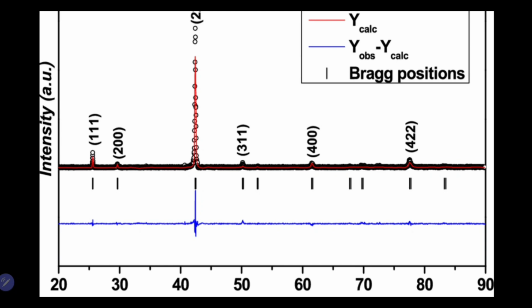So in the Heusler alloy, I opened this X-ray diffraction pattern of some Heusler material. Okay, so this is a 2 theta versus intensity plot. In this, we can see that this 220 is the main peak, which is also called the fundamental peak. Then there are 2 more peaks at low angle. One peak is the 111 reflection, and another is the 200 reflection.